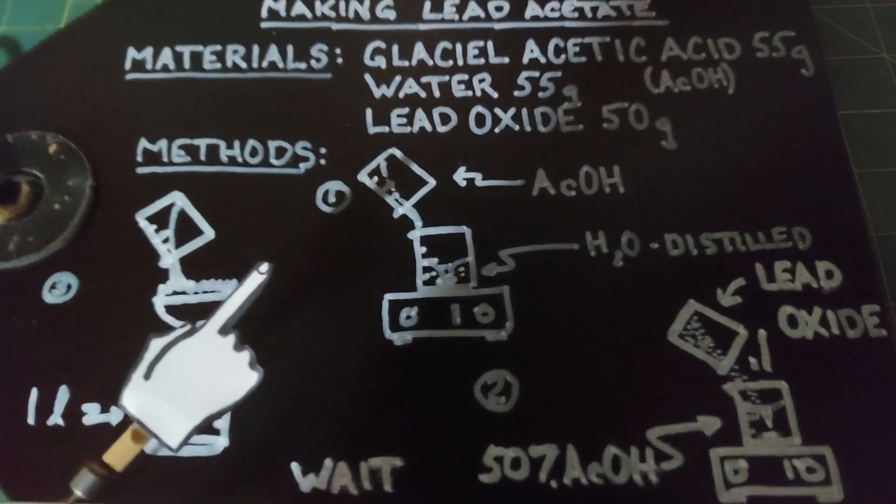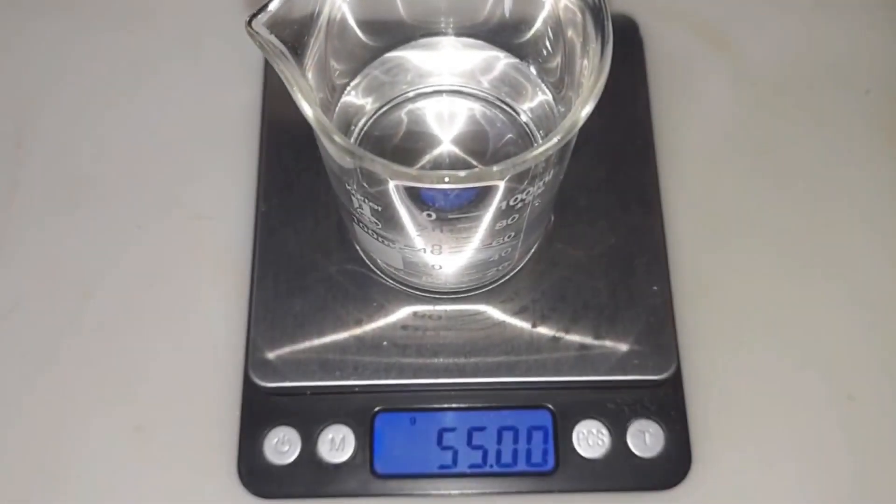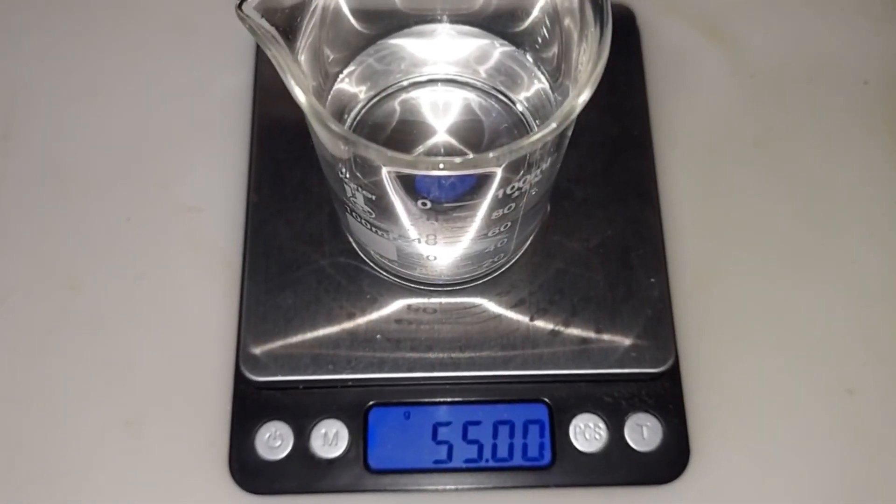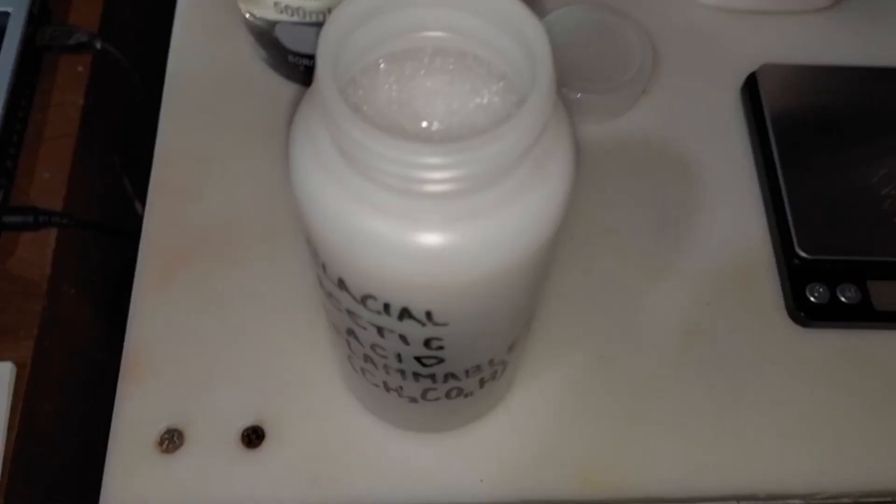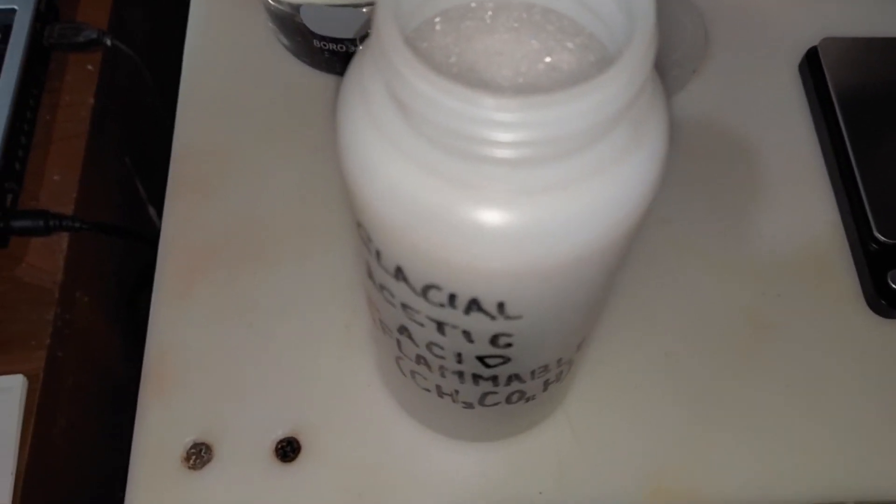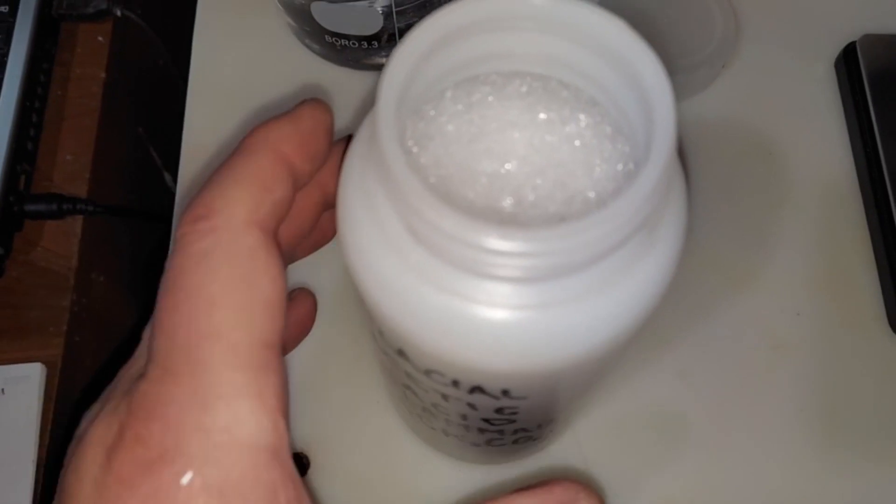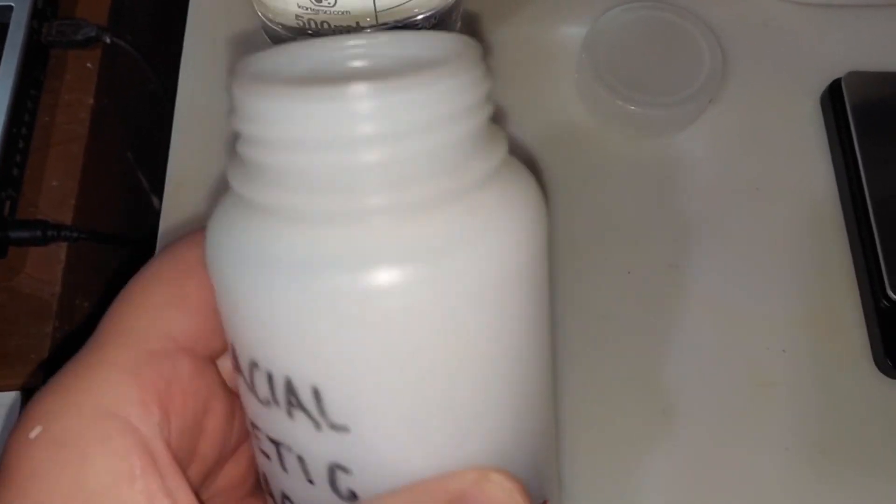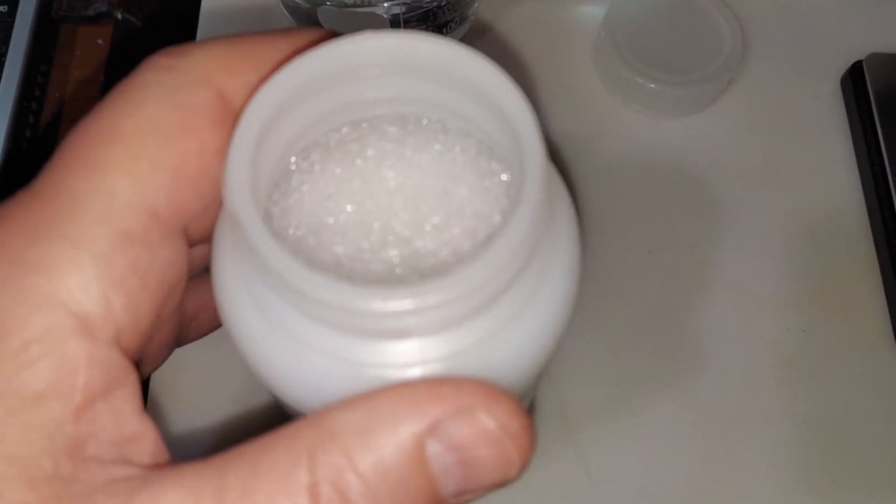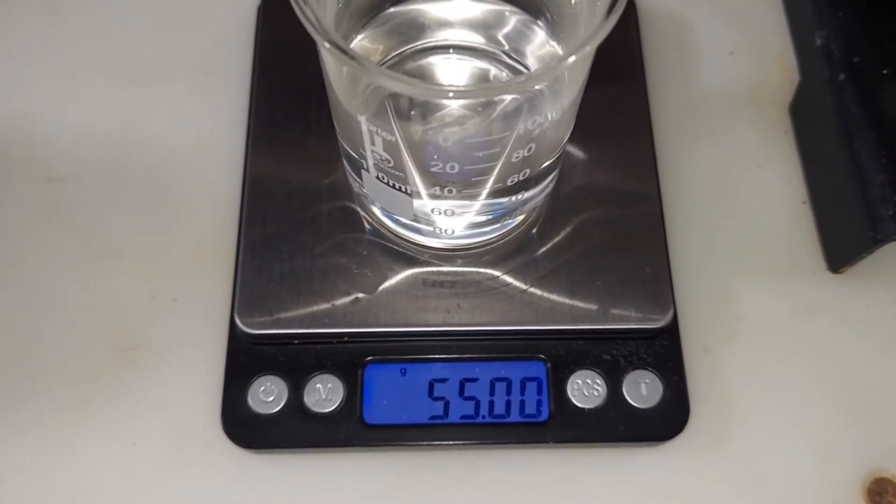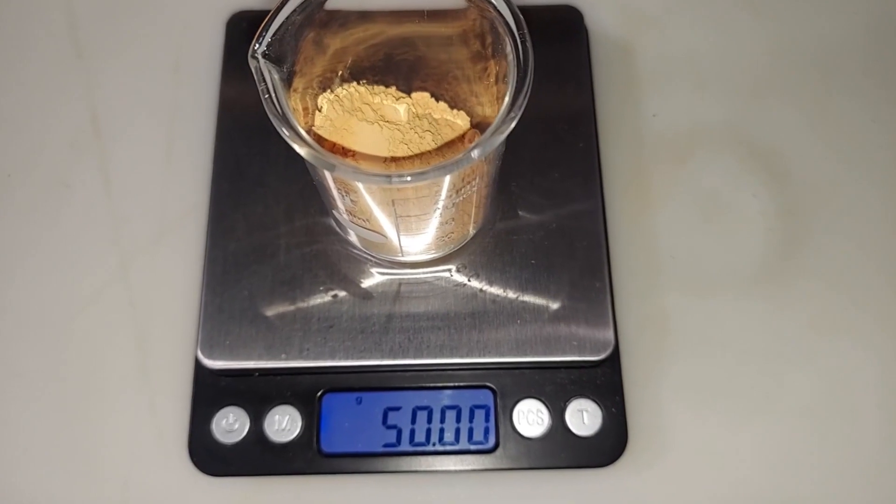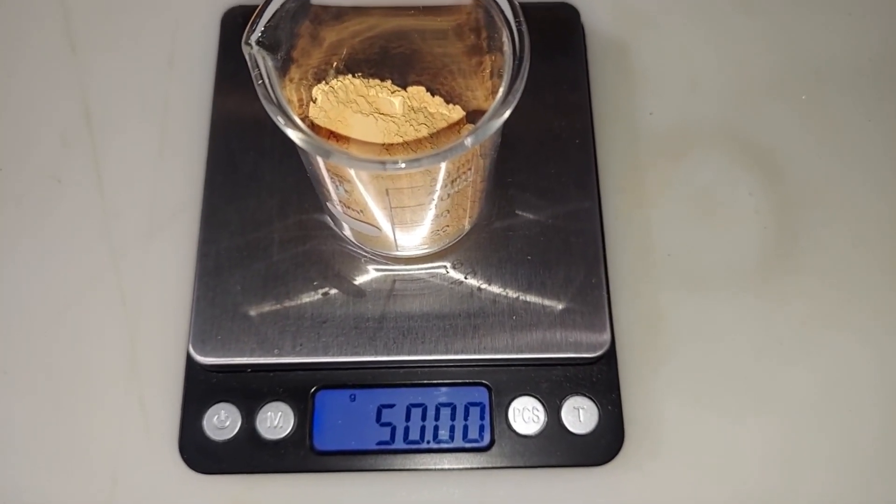To start making our 50% acetic acid solution by weight, we're going to start with 55 grams of water. Something interesting about glacial acetic acid is that it turns into a solid below 63 degrees Fahrenheit, so this is rock hard and also it's flammable. After I melted it, 55 grams of pure acetic acid. And our final ingredient in making our lead acetate is 50 grams of lead oxide.